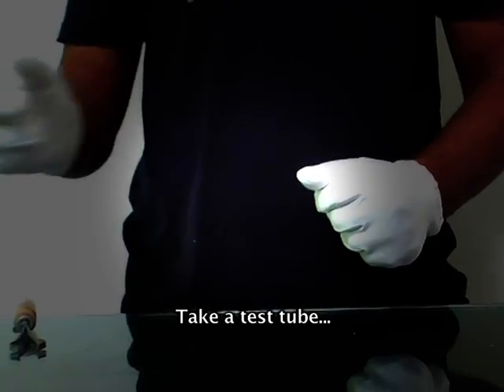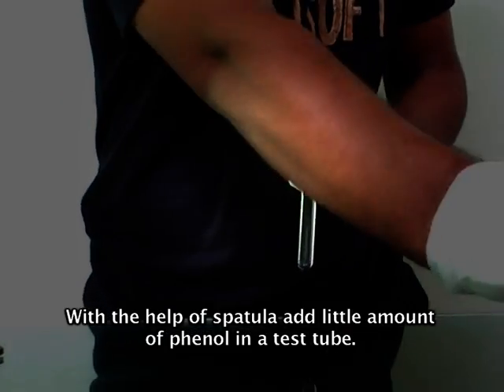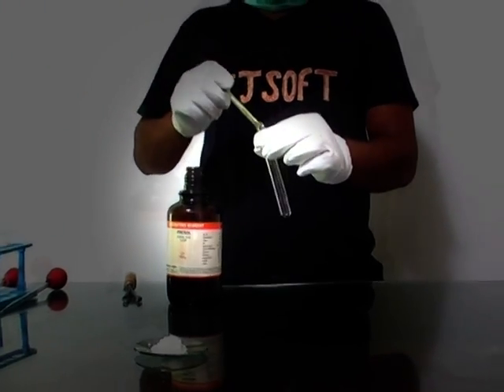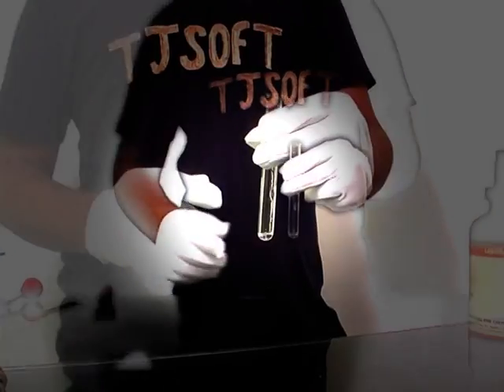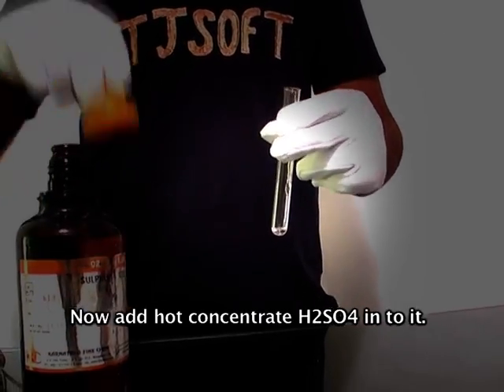Liebermann's reaction is another experiment to confirm phenol. Take a test tube. With the help of a spatula, add a little amount of phenol in the test tube. Now add hot concentrated H₂SO₄ into it.